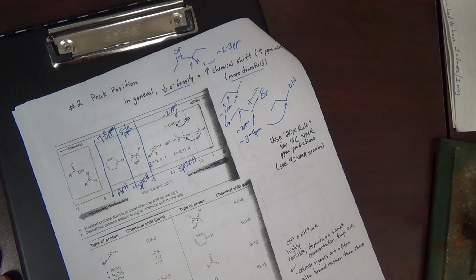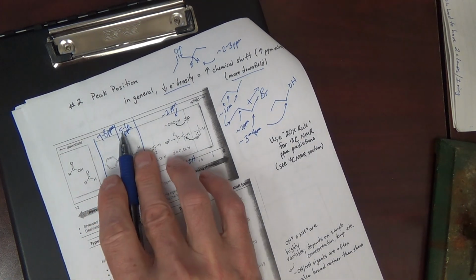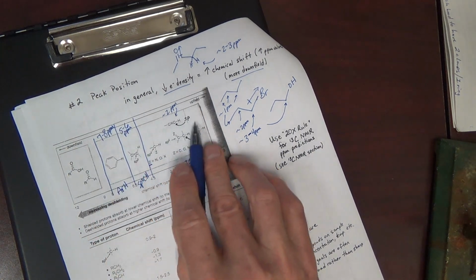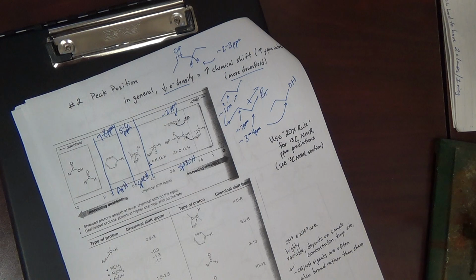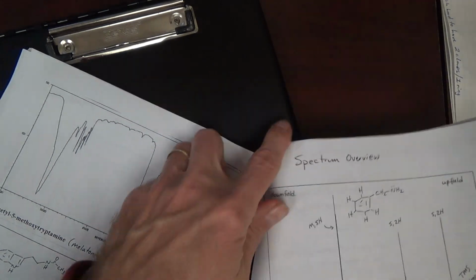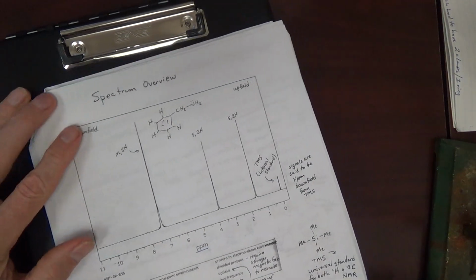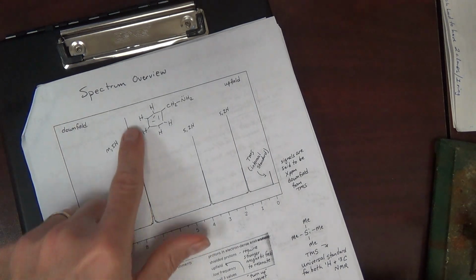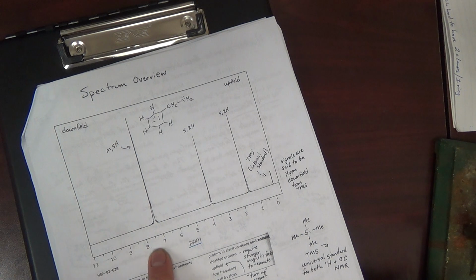Classical aromatic region. Now it can be higher or lower than that. Okay. So can these. These not so much. Aromatic region, 7 to 8 ppm. Have we seen such before? You remember the spectrum overview? Remember the aromatic hydrogens? We said they were here. See? About 7 to 8 ppm.